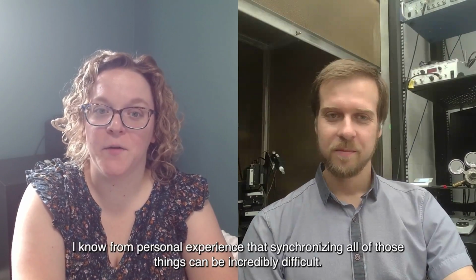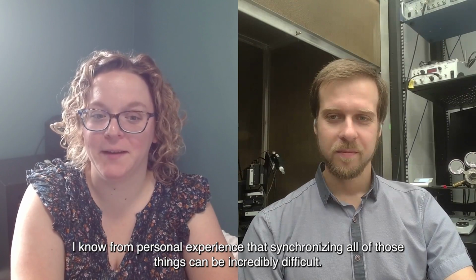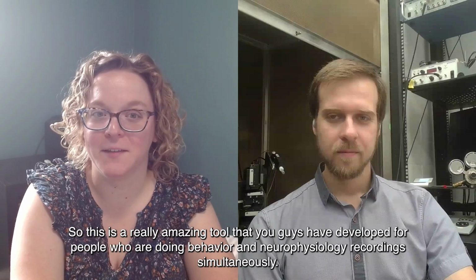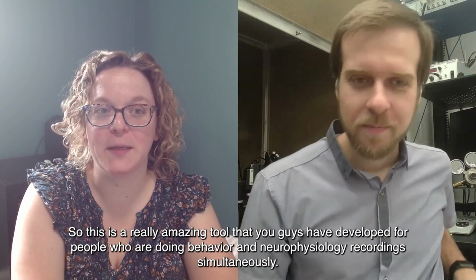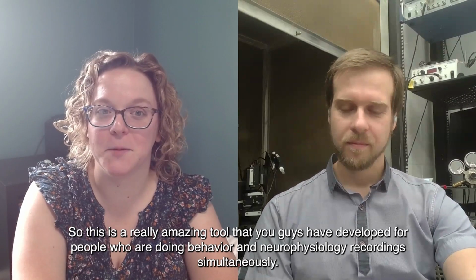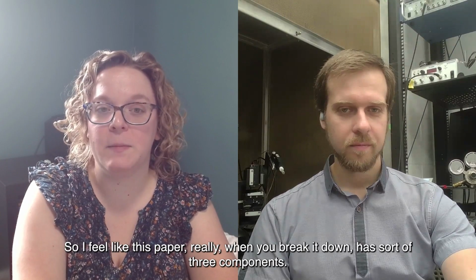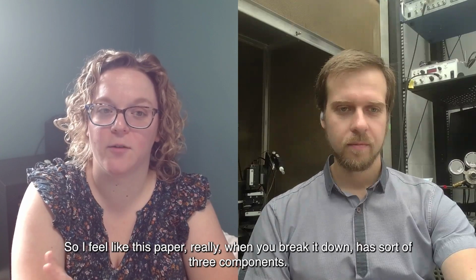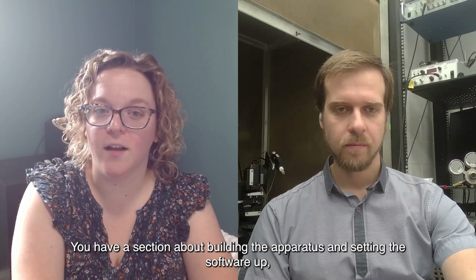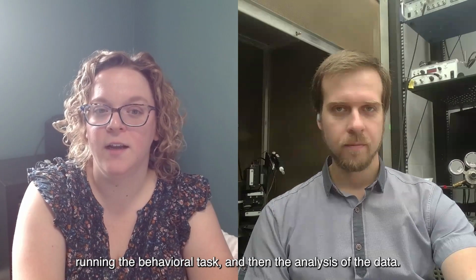Great. Yeah, I know from personal experience that synchronizing all of those things can be incredibly difficult. So this is a really amazing tool that you guys have developed for people who are doing behavior and neurophysiology recordings simultaneously. I feel like this paper, when you break it down, has three components. So you have a section about building the apparatus and setting the software up, running the behavioral task, and then the analysis of the data.